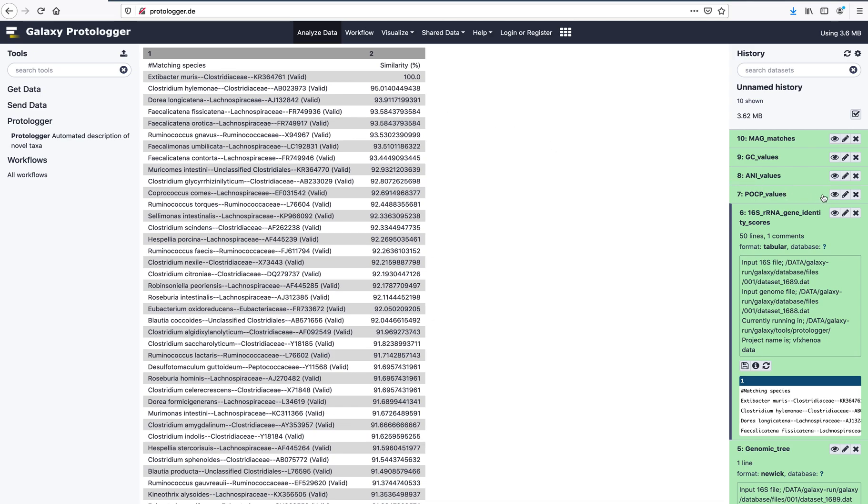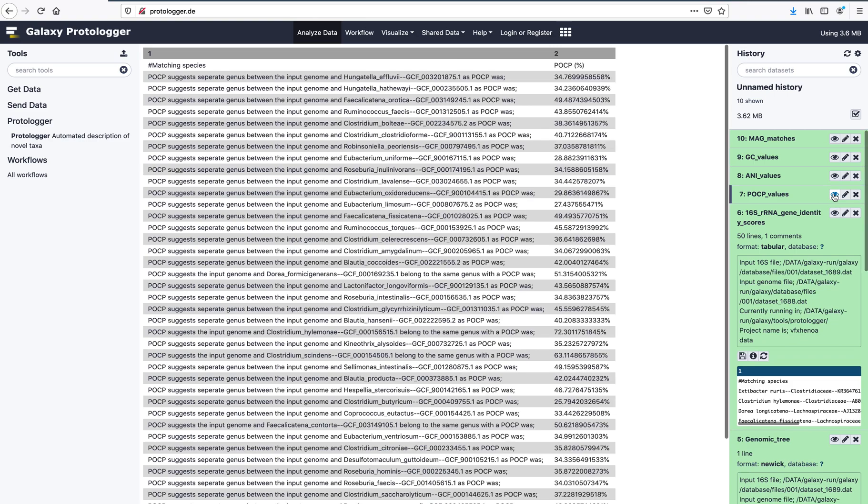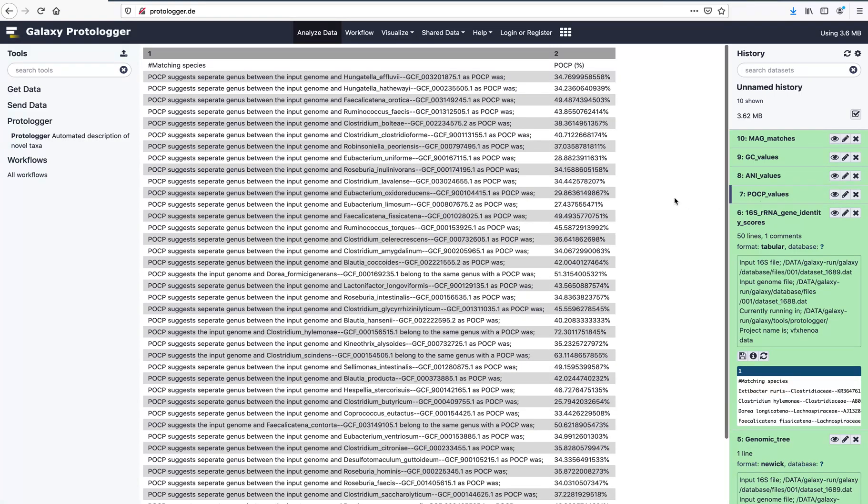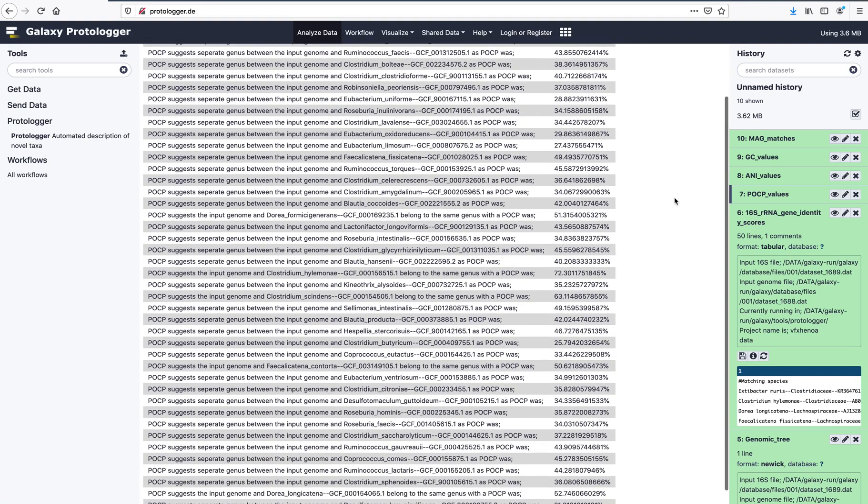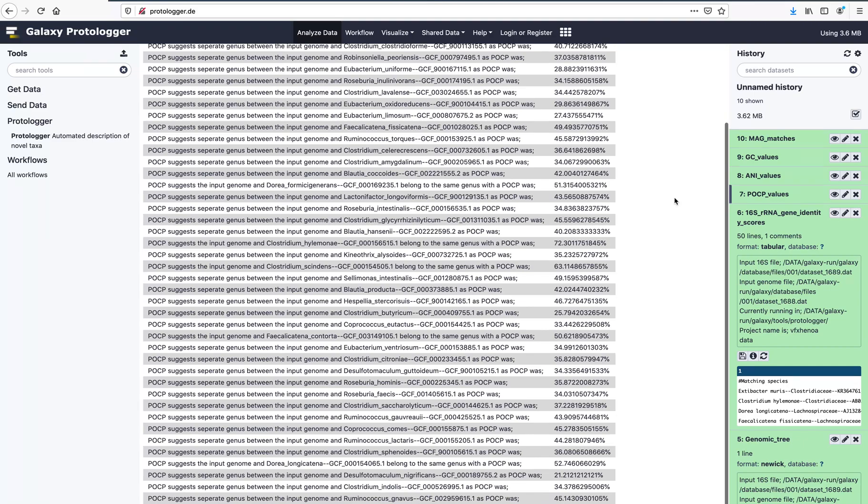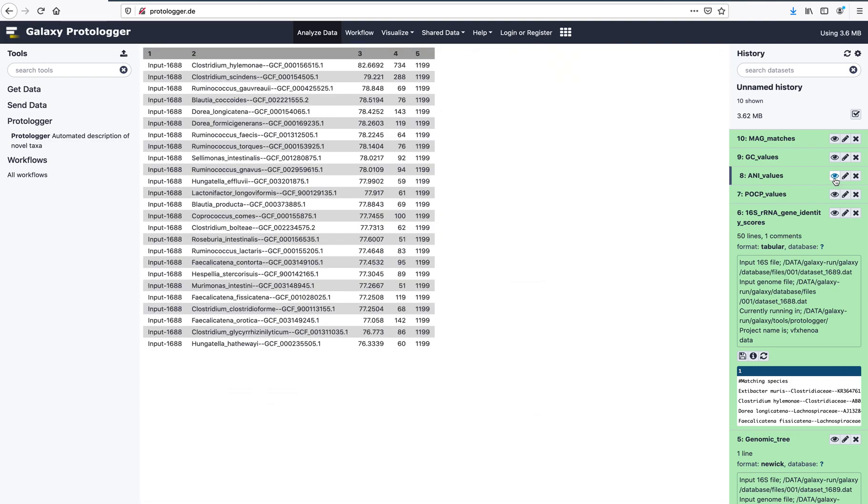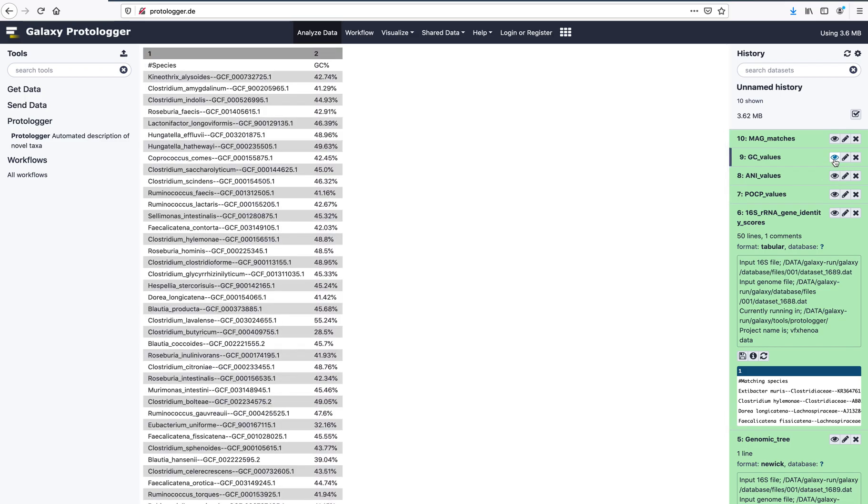Pairwise analysis files are also produced for the POCP and ANI comparisons. The GC content of each close relative is also provided for comparison to the input isolate.